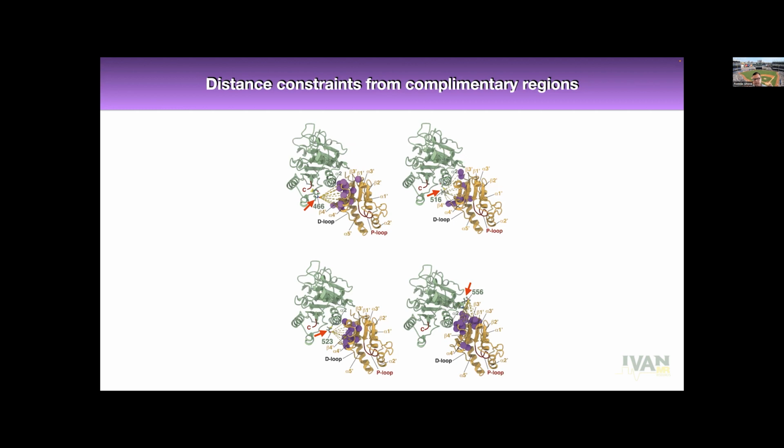So when you're comparing the paramagnetic and diamagnetic resonances, do not forget to make sure that you have enough of a pre-delay or enough dummy scans. If you don't have enough of a delay in your diamagnetic experiment, you would reach a very different steady state between scans than you would in a paramagnetic experiment, simply because your T1s have been reduced in the paramagnetic experiment. So that's something to remember if you're going to quantify things and get reasonably good quantification of the paramagnetic effects, since you're looking at line intensities, which is essentially what we did.